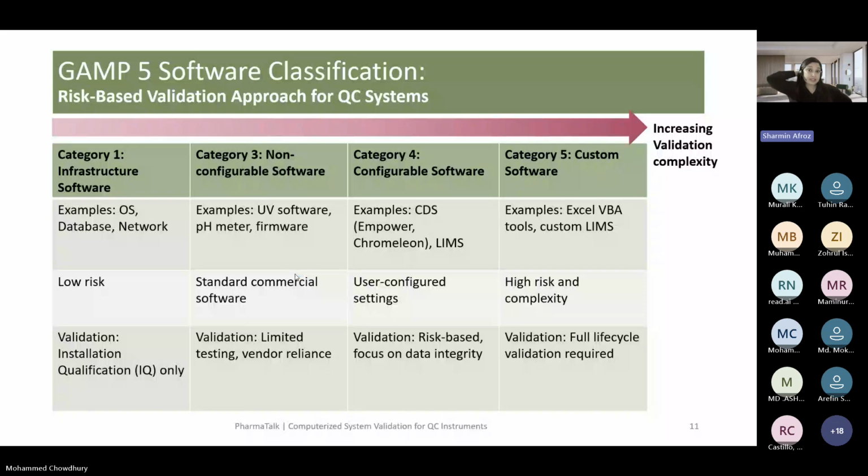Okay, I think these are the legacy systems. So the auditors will check our mindset to improve, because all the systems were once in SCADA and chart recorders. In earlier times we recorded the refrigerator data on chart recorders, and the printout comes, and now it is stored in a server, with backup, and the cloud system.